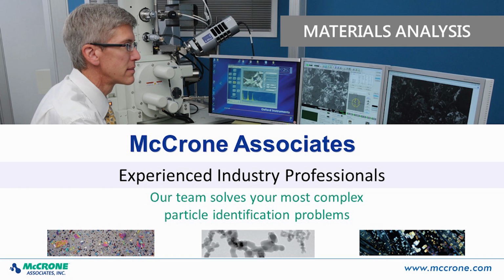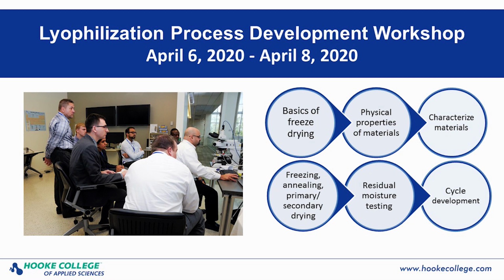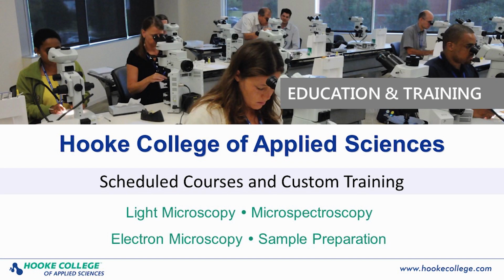Well, that's a good question, Chris, and one we hear relatively frequently. Without the ability for controlled nucleation, unfortunately, your options for optimizing the freezing side of your cycle are a bit more limited. That's something I briefly touched on in the presentation: you can start looking at experimenting with varying freezing rates as well as the addition of a potential annealing step. The addition of the annealing step is when you would, as many people know, raise the temperature of your shelf and product to put a little more energy into that crystal lattice structure and allow the ice crystals to rearrange into larger ice crystals, which does help improve the uniformity within your vials.